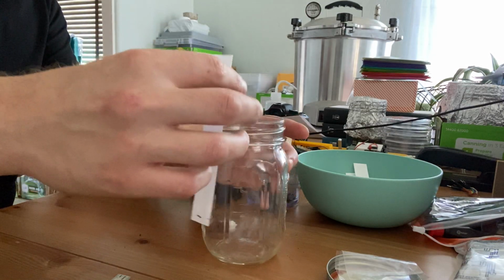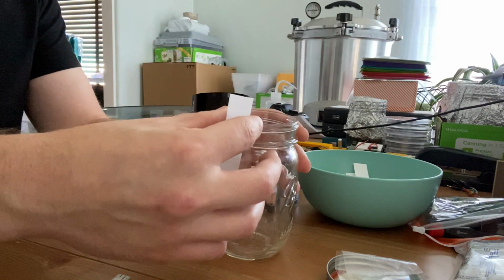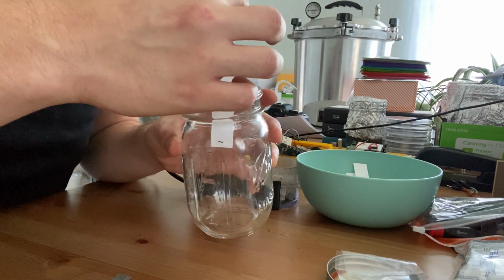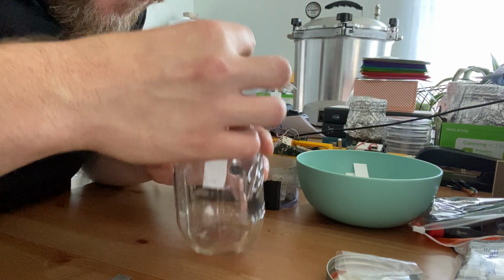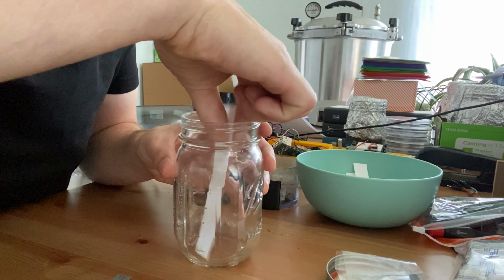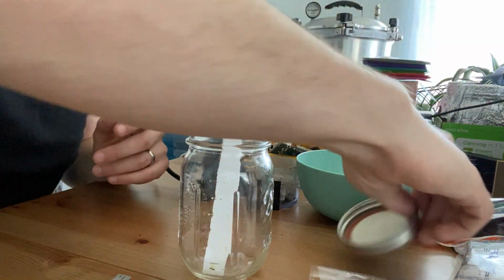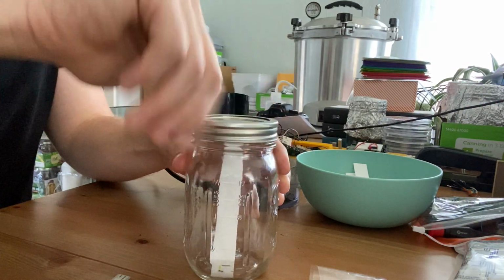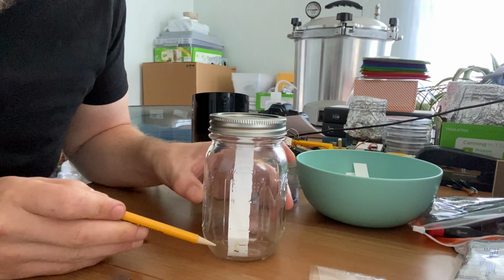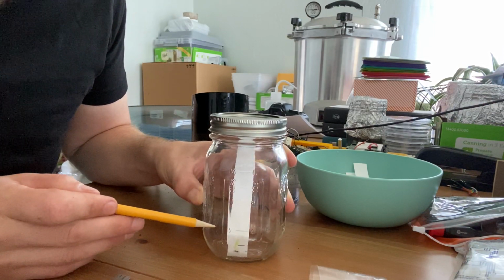which happens to be where the paper sits. And then the paper's going to go inside of here, and immediately will start to be sucked up by the paper. So let me make sure I've got enough in here. And it looks like I do. All right, so now it is working, and I'm going to put the lid on so my solvent doesn't evaporate. And you can already see what's happening: the solvent front is slowly rising.